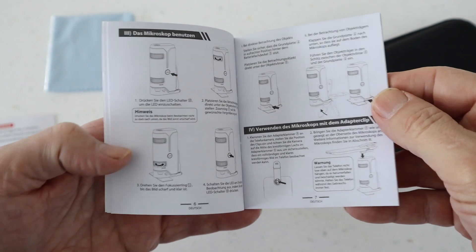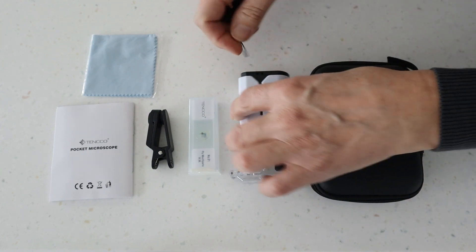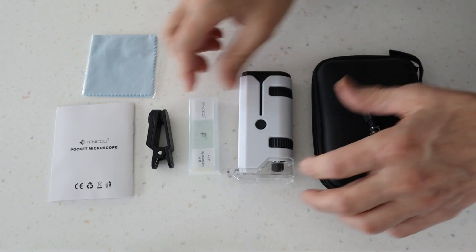You also get a wipe for cleaning the lens. You also get this little strap which you can put around the microscope — it just slots in — and that's just a little wrist strap if you want to attach it, but that's optional.